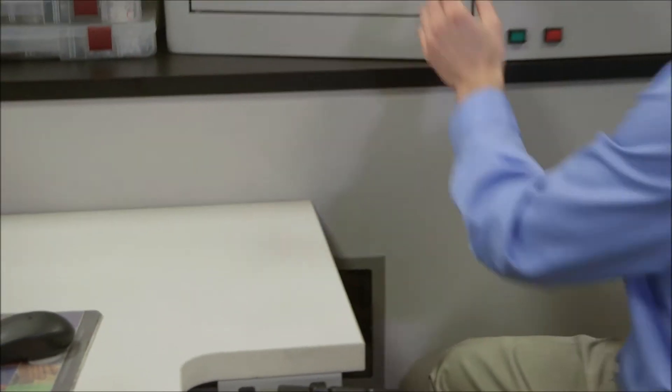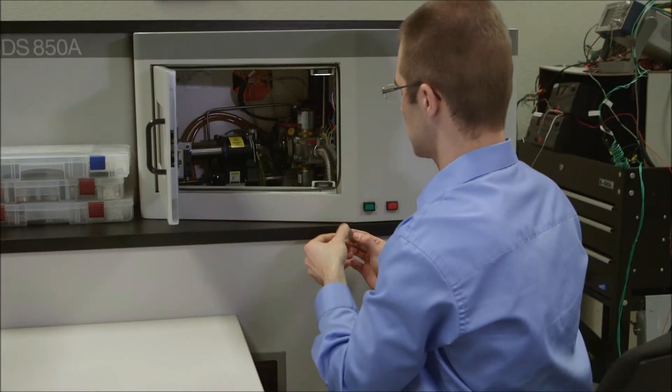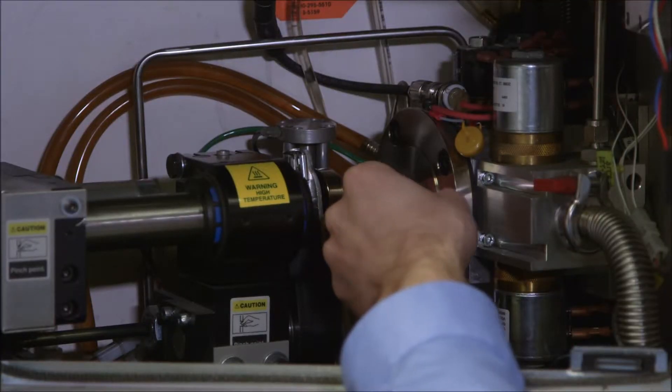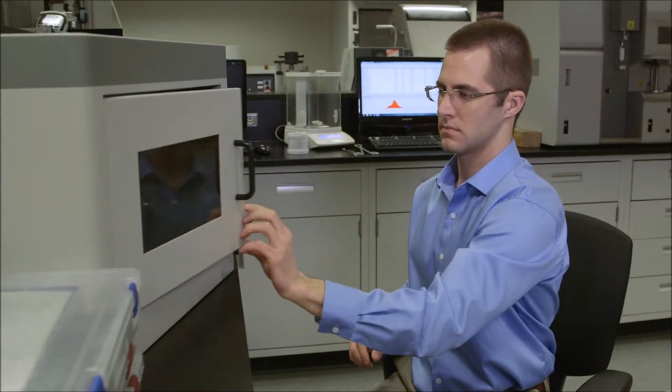We can take a small section out of any one of our components, or out of a competitor component, and mount it within our machine. In about five minutes, this will give us a full chemical composition of that material.